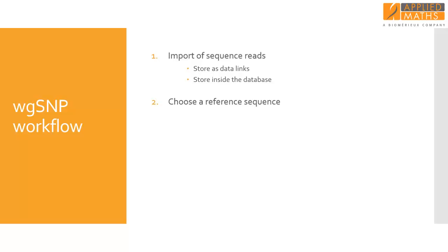Next, a reference sequence needs to be selected. The choice of a reference sequence in a whole genome SNP analysis is very important, since only genomic information that is in common between the reference sequence and the sample sequences will be included in the analysis. This means that the reference should be as similar as possible to the sample sequences.